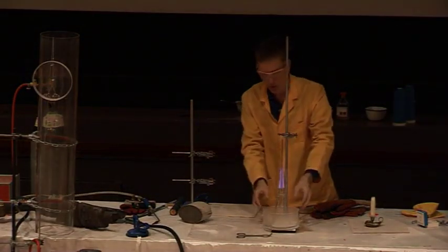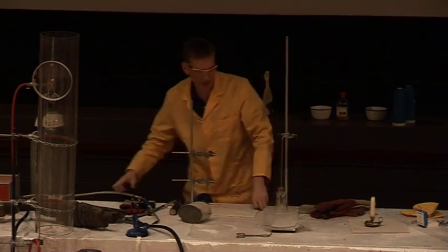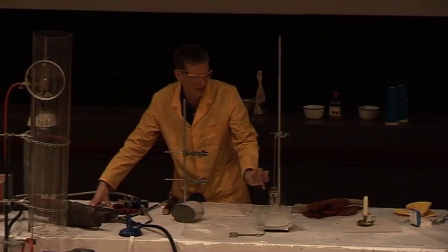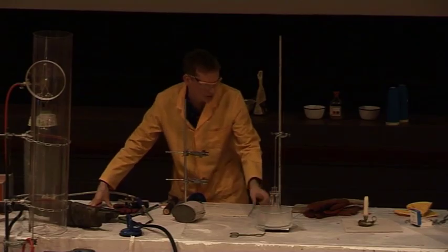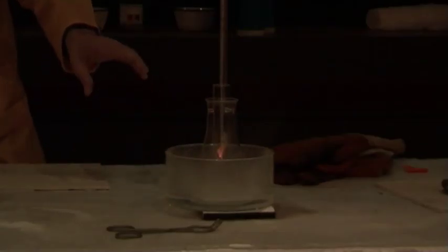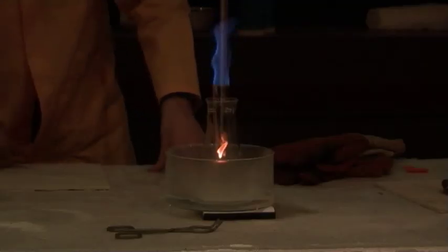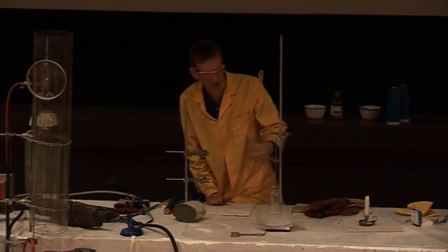And you should see, as this reaction takes place, the catalyst here will begin to glow. This is as the methanol and oxygen are coming into contact with the metal, and they're both beginning to react there, and this will heat up the catalyst, and it should glow red hot, I hope. Oh, there we are. It's beginning to glow, and any second now it will probably light the methanol vapor. There we are. I'll blow out the flame, and the whole process should start again.